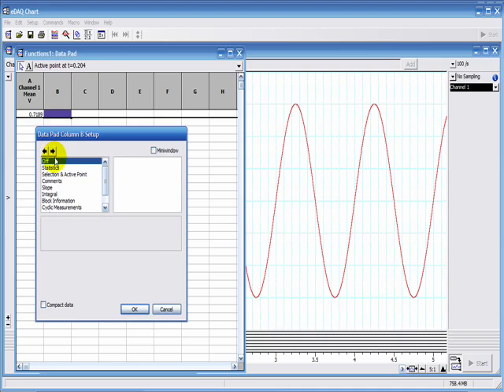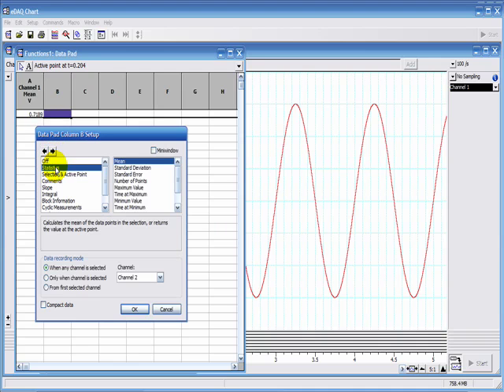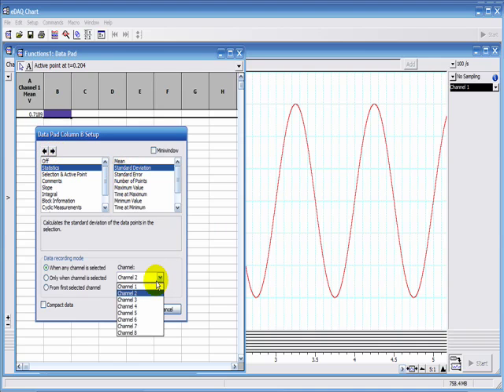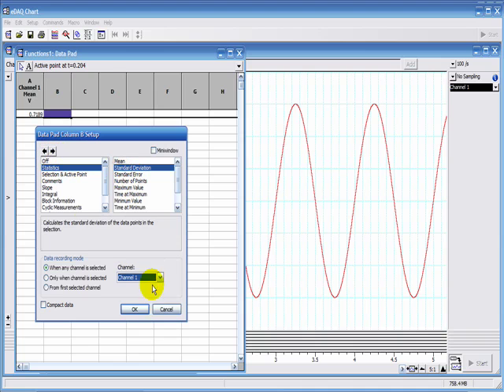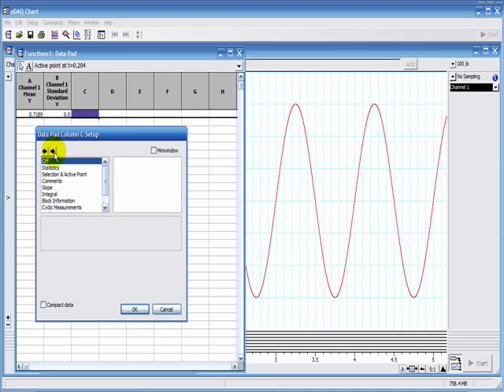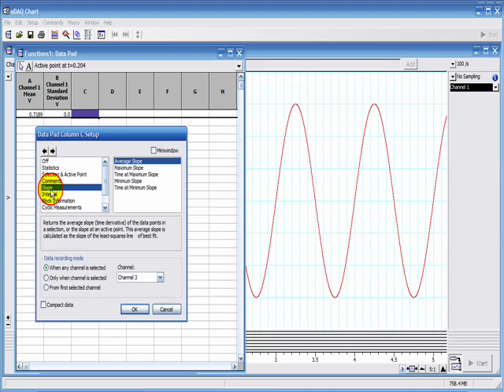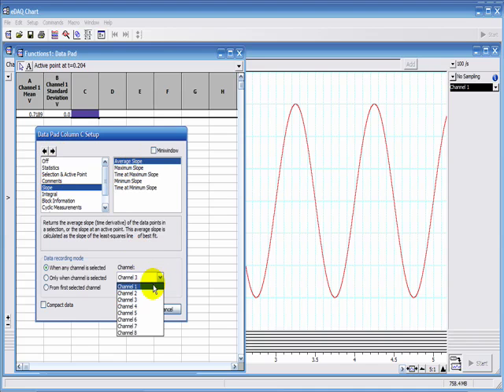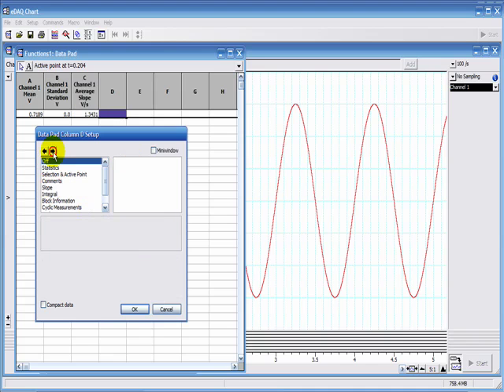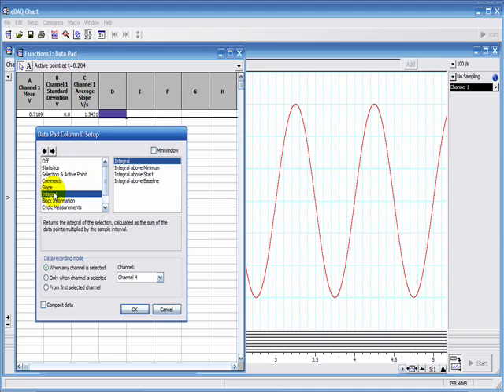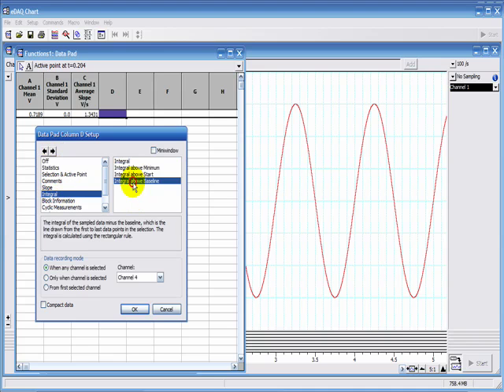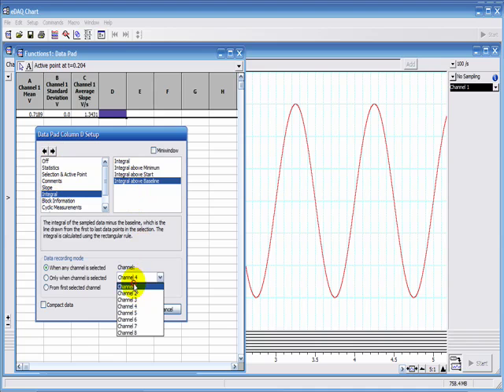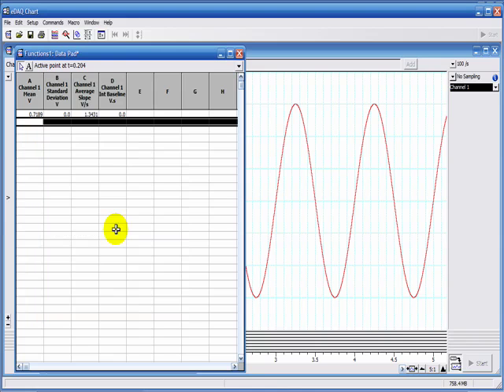I'm going to go across to column B and I'm going to find the standard deviation of channel 1, go across to column C and find the average slope of channel 1, go across to column D and find the integral above the baseline of channel 1. So now I've set up my four calculations I'm going to do.